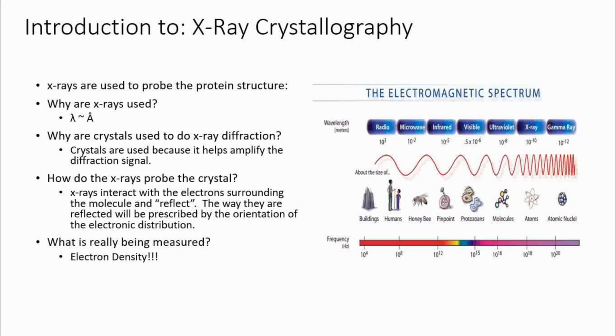Now based on this, what we can see is, if we are getting a higher intensity of X-ray after passing through your sample at a particular spot, that means the electron density from where the diffraction has happened is very less, compared to another spot where the diffraction has happened and the intensity of X-ray onto the detector is very less. That means the electron density which this particular X-ray has experienced is way more, and that is why you are experiencing a high diffraction of the X-ray, and the end intensity of the X-ray detected at the detector is very less. Okay, so this should be clear, what we are looking for and why we are looking for it, right?